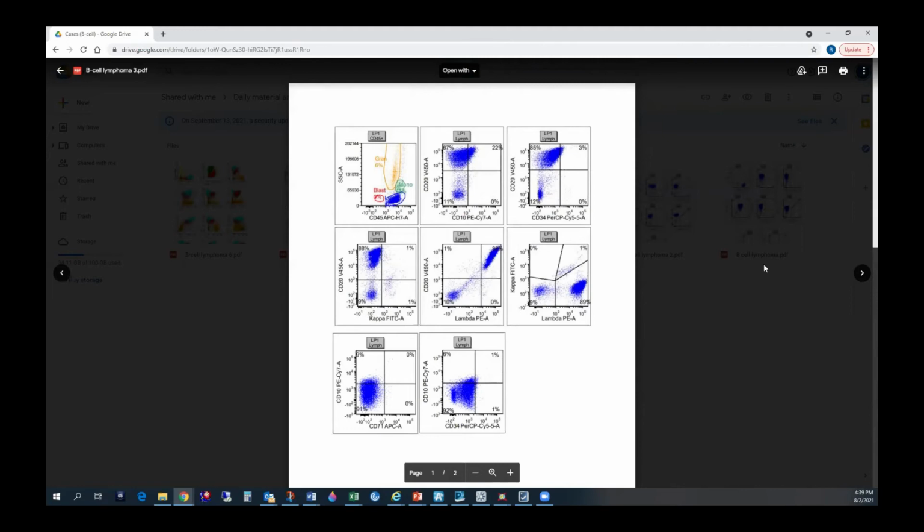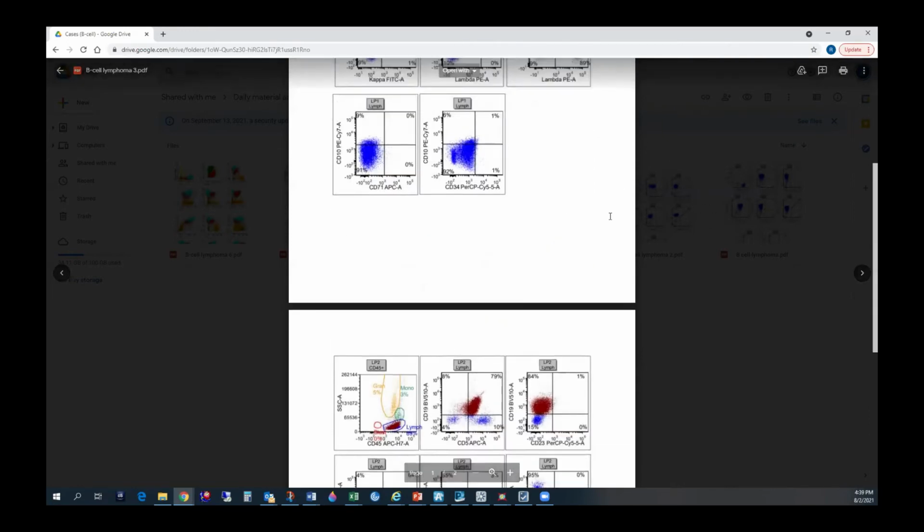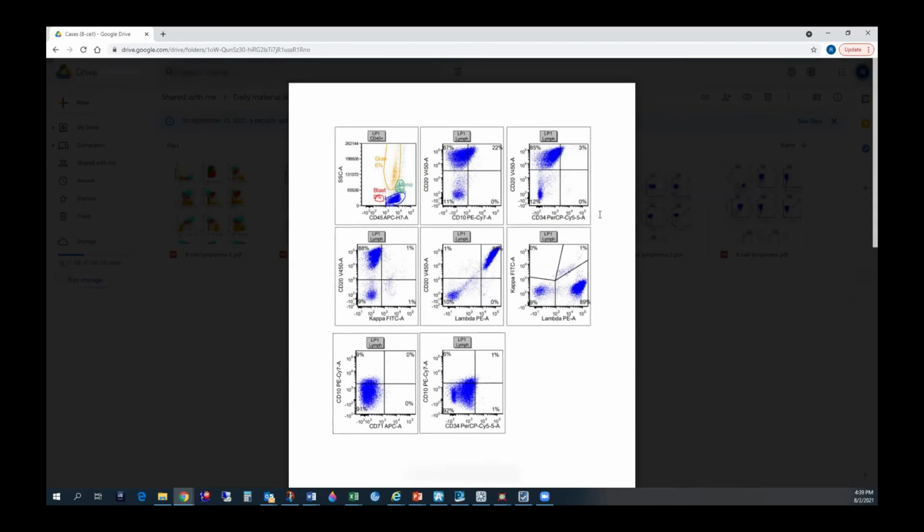If it is a CD5 positive neoplasm, we mention CD20 if it is bright, just to give a clue that it doesn't look like a CLL. For established cases, we try to comment if it's dim, moderate, or strong. We do the same. We only mention dim or bright for kappa, lambda, CD20, and only in the appropriate scenario. Otherwise, just positive and negative and leave it at that.